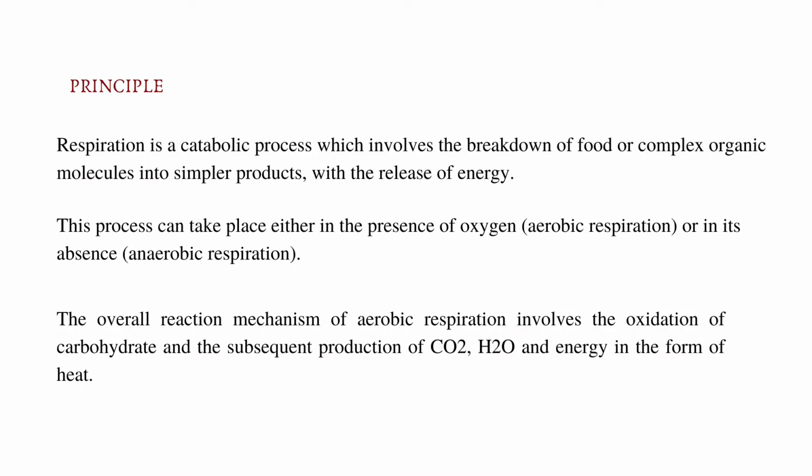Principle. Respiration is a catabolic process which involves the breakdown of food or complex organic molecules into simpler products with the release of energy in the form of ATP. This process takes place either in the presence of oxygen, that is aerobic respiration, or in its absence, that is anaerobic respiration. The overall mechanism of aerobic respiration involves the oxidation of carbohydrate and the subsequent production of carbon dioxide and water along with energy.